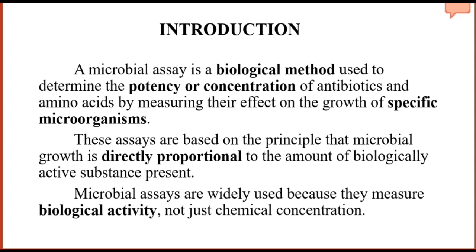These assays are based on the principle that microbial growth is directly proportional to the amount of biological active substance present. Microbial assays are widely used because they measure biological activity, not just chemical concentration.